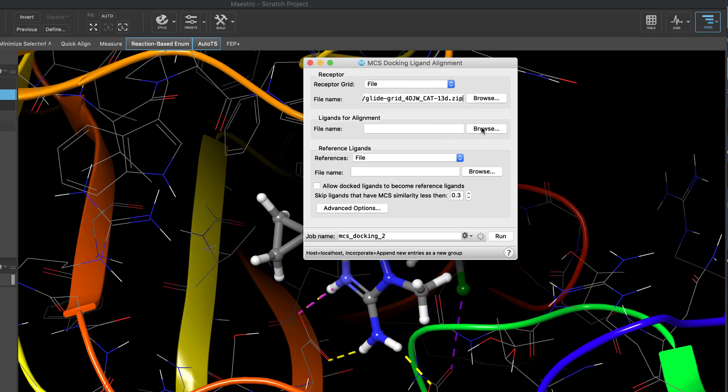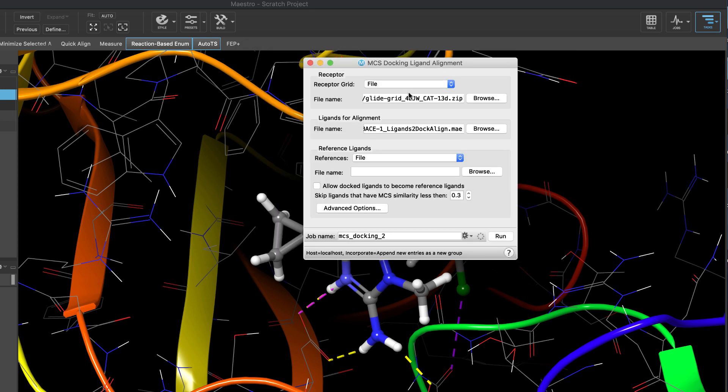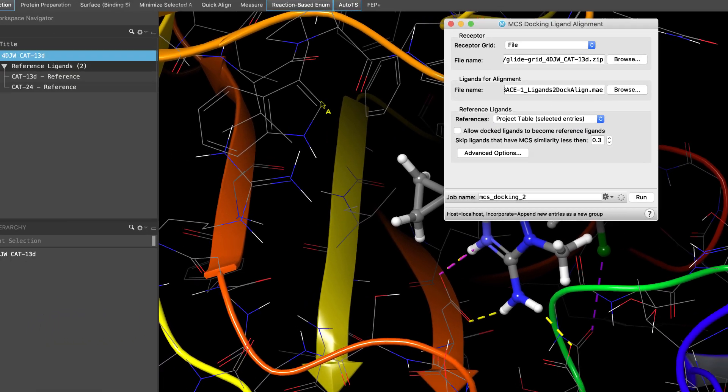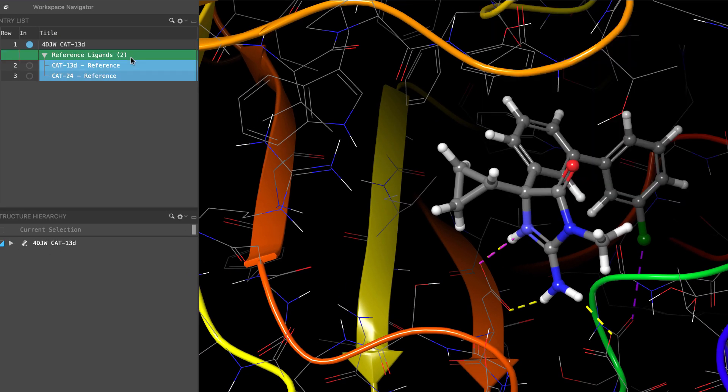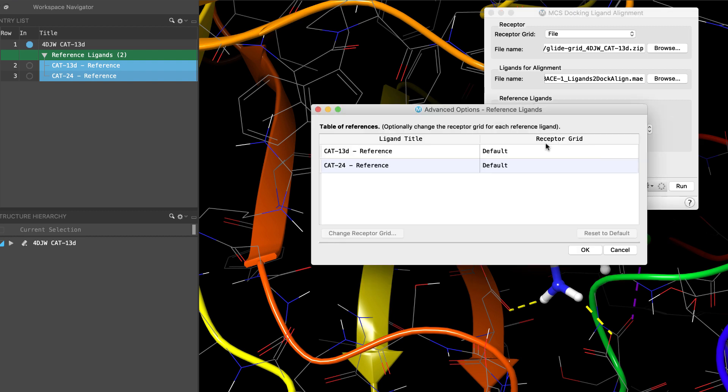Select the file with the ligands to be aligned. This will use MCS docking as the alignment method, and specify the ligands to be used as references for the docking alignment. Docked ligands also have the ability to become references, and in the advanced options, you can optionally set any of the references to have their own receptor grids.